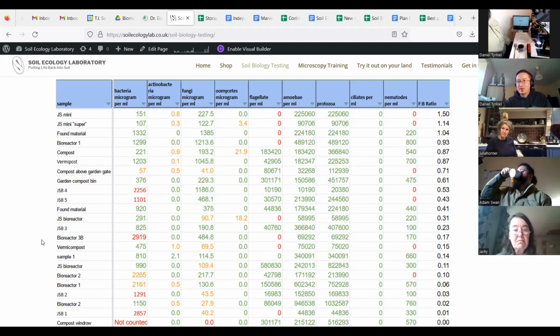So that's in general what the system is. And what we measure is mainly the soil food web, mainly the system which doesn't require colonization of roots. You can use the microscope to assess colonization of roots by mycorrhizal fungi, but the process is much more involved. You have to clean the roots and then boil them for 2 hours in vinegar, and then stain it, and then you're ready to look under the microscope. So it's a very, very involved process, and it's not something that we'll be demonstrating.